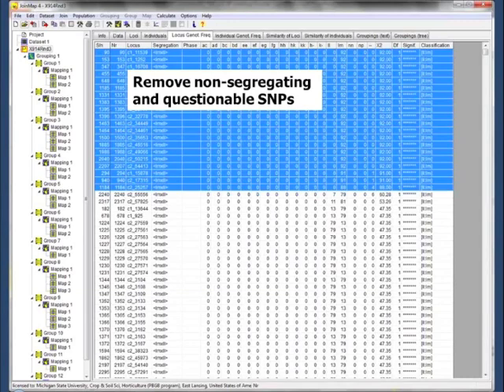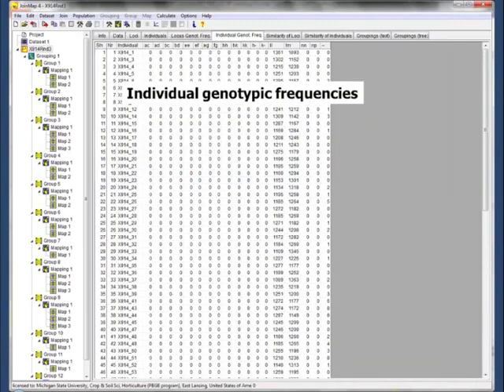So the ones that we have highlighted in blue, all these were the ones that had a heterozygous parent and a homozygous parent. We expected a 1-to-1 segregation, and we had 92 to 0. So we removed those. However, we kept in the skewed ones you can see here, 79 to 7, 81 to 11. We didn't want to remove them at this point yet, because we know if you go into the literature that there's a lot of skewed segregation in the diploid population, especially when there's wild species involved.